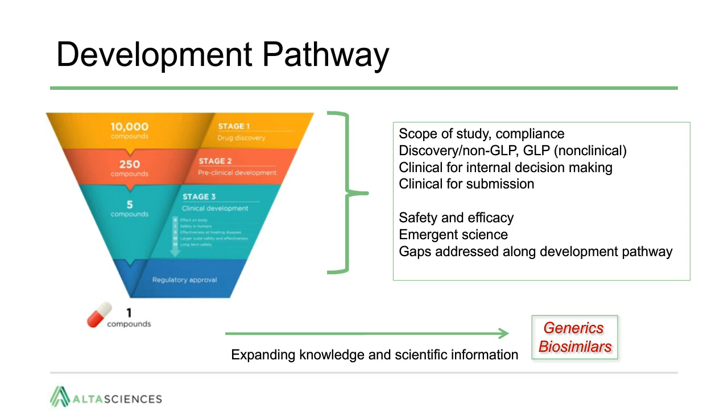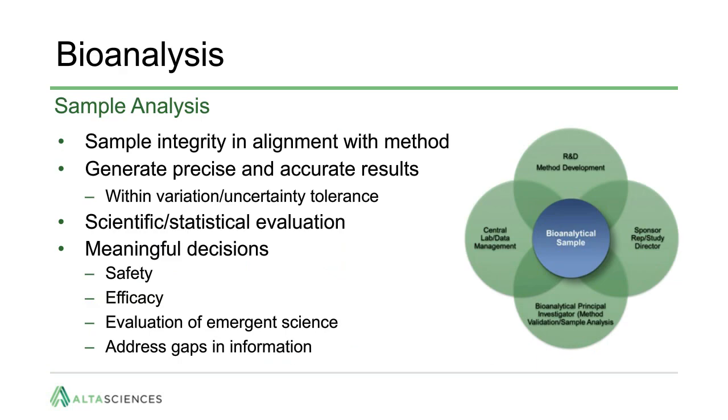As development progresses, information is compiled on safety and efficacy. Bioanalytical results from one study can be the driver for additional studies. Along the development pathway, gaps in data and knowledge often become evident and need to be addressed. Following initial success in the clinic, non-clinical and clinical studies can be ongoing simultaneously. As bioanalytical scientists, our objective is to generate accurate and precise data based on an understanding of the defined variation of our methods and uncertainty tolerance accepted on the data.